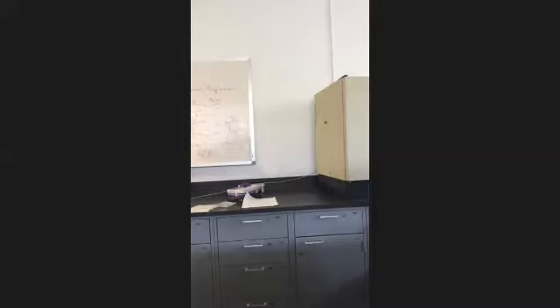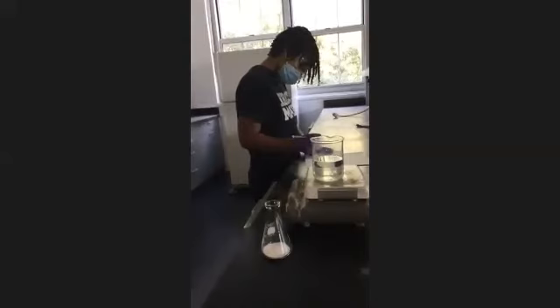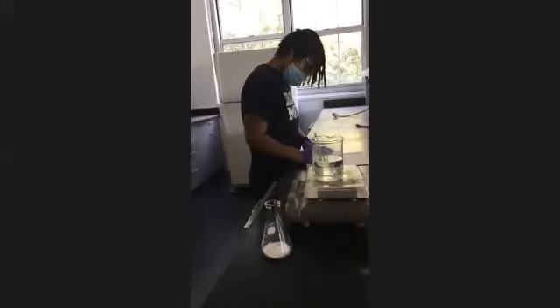So we're gonna add first the acetic anhydride, and it's 7 milliliters. So those of you who are watching, I'm gonna focus on this right here. You can see the flask on the table. And I got a little syringe I'm gonna use, and I'm gonna just come around each group.